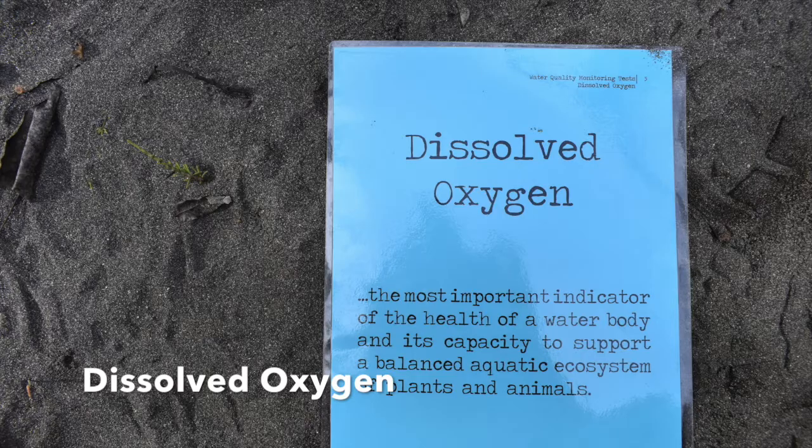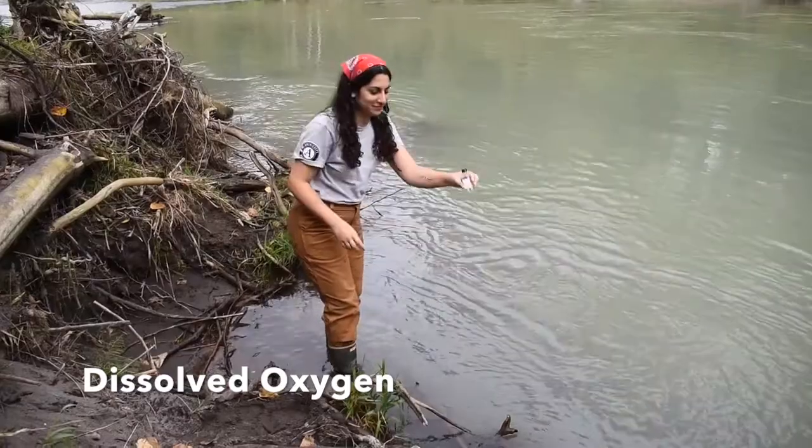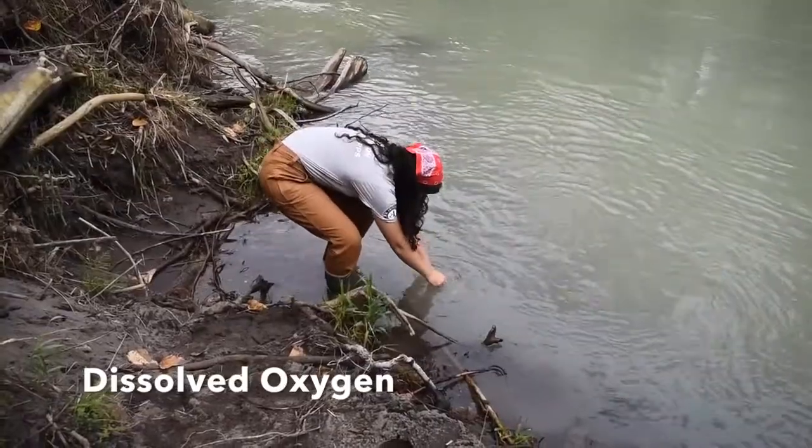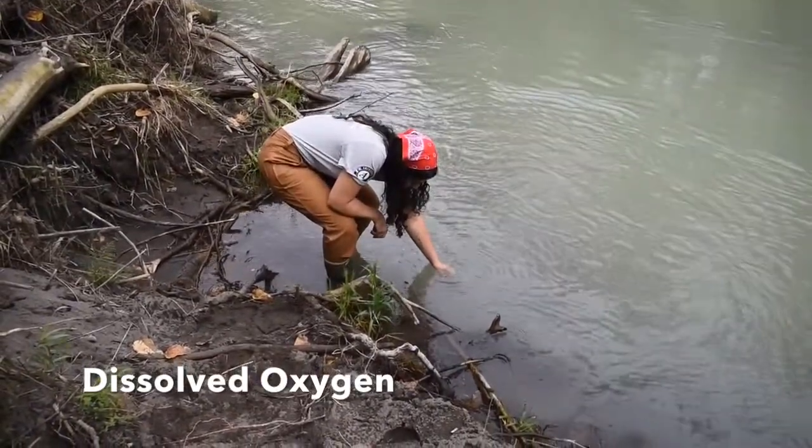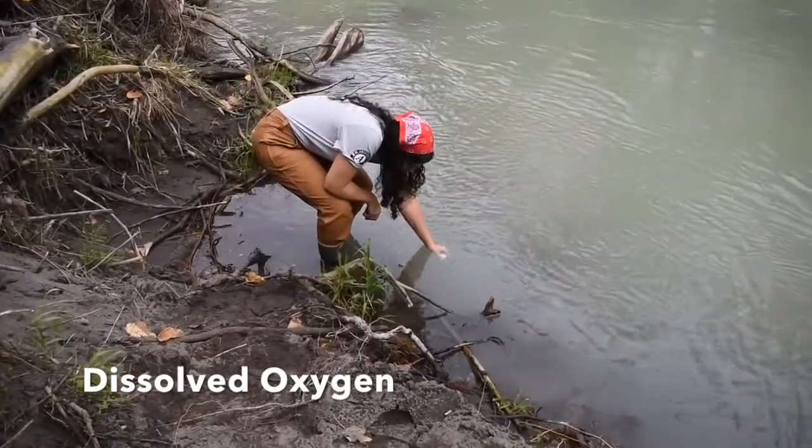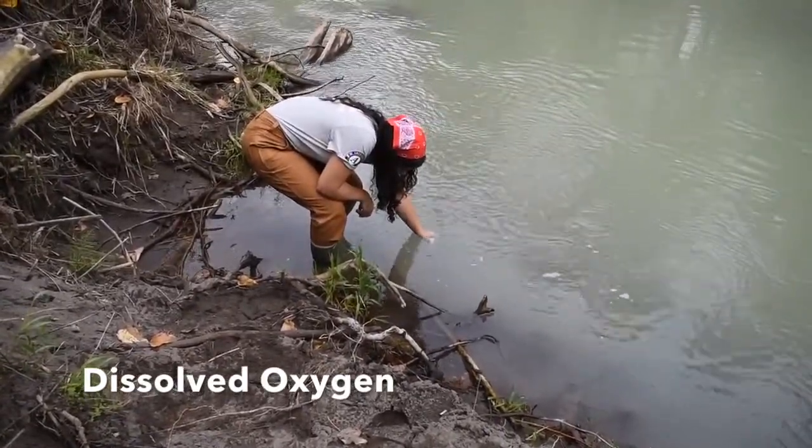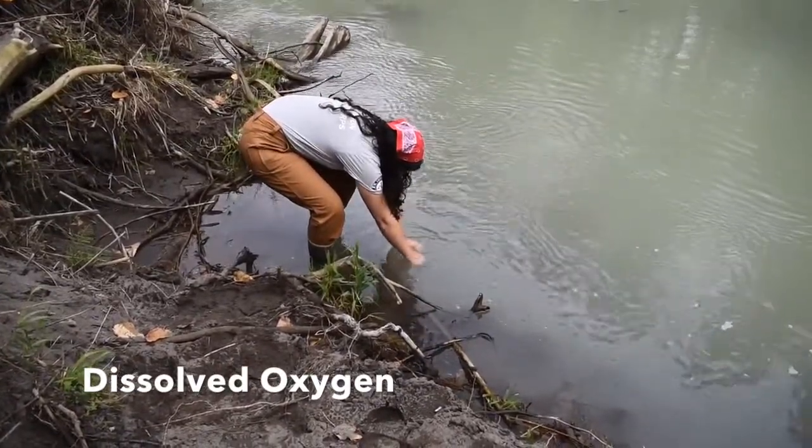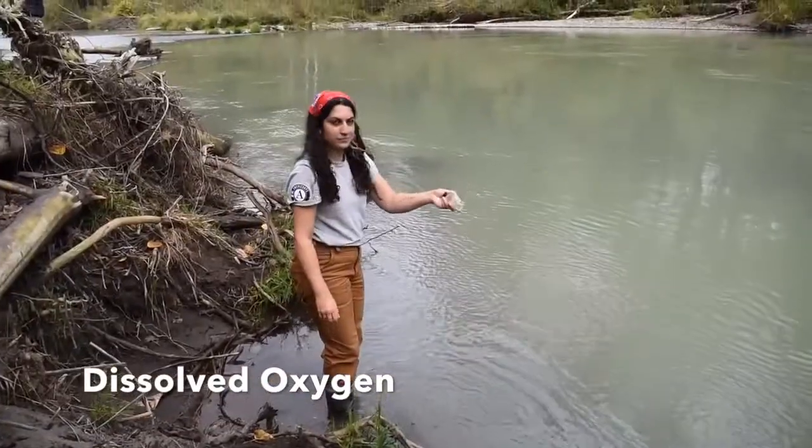To test dissolved oxygen, we need to collect our water a little bit differently. First we submerge our collection bottle under the water with the cap on, then remove the cap and tilt the bottle upward to release all of the bubbles. After holding the bottle facing upstream for one minute, we will cap it under the water and bring it out and check that there are no bubbles.